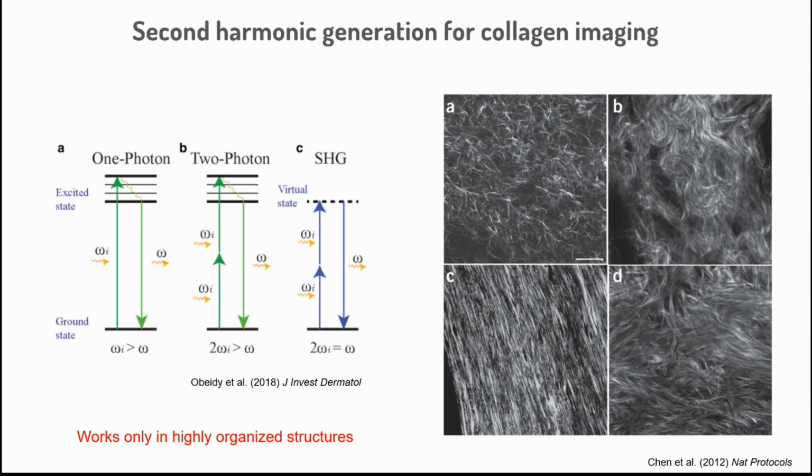But it's very useful because you can have what we call label-free imaging. You can see a structure without labeling it, without a fluorophore, without a virus, without anything, just because the tissue is organized in a particular way.